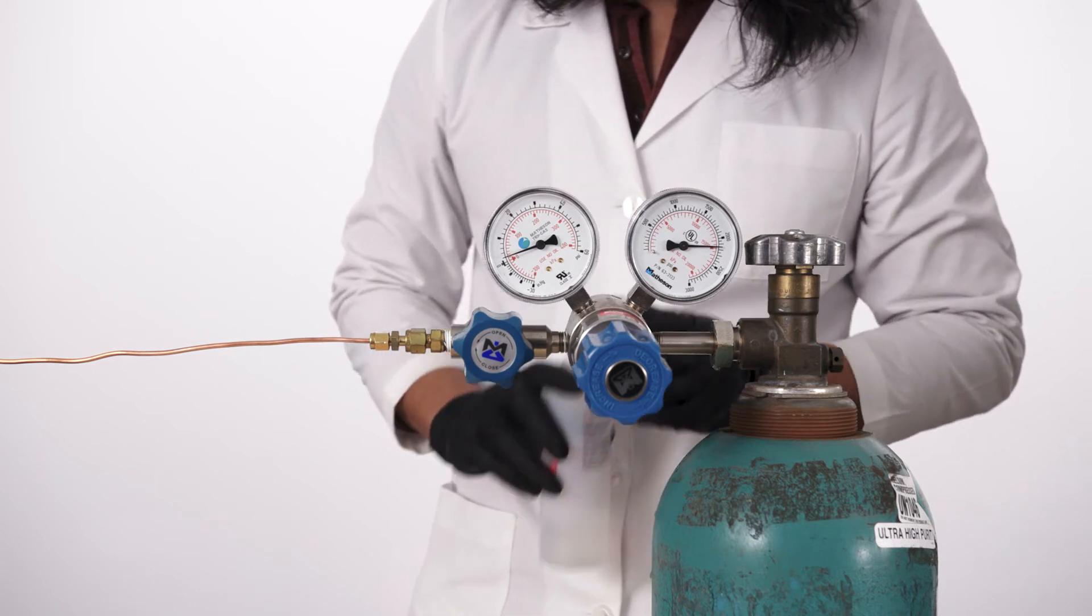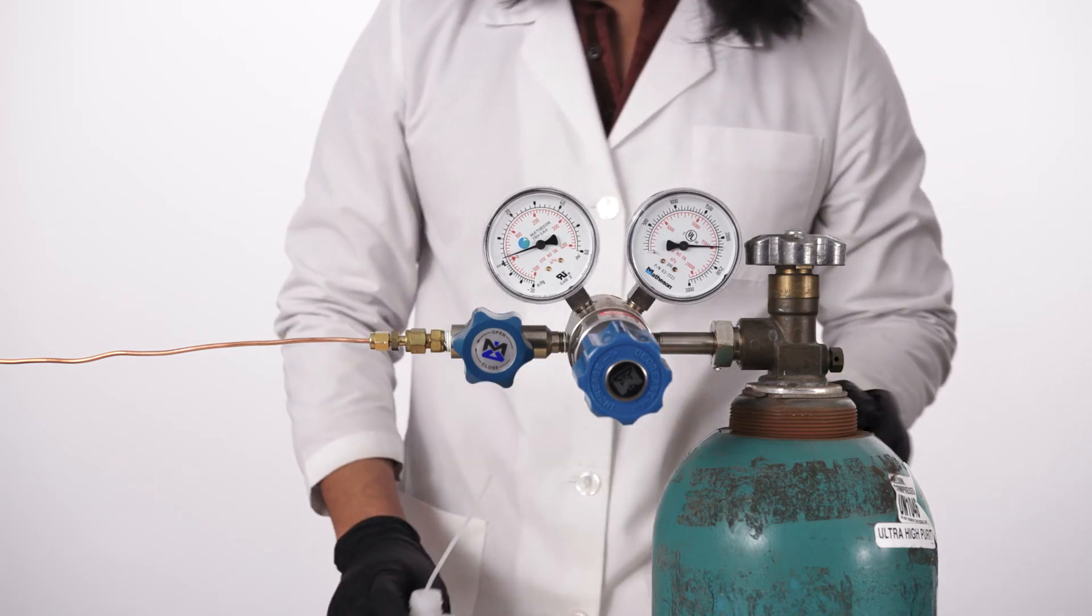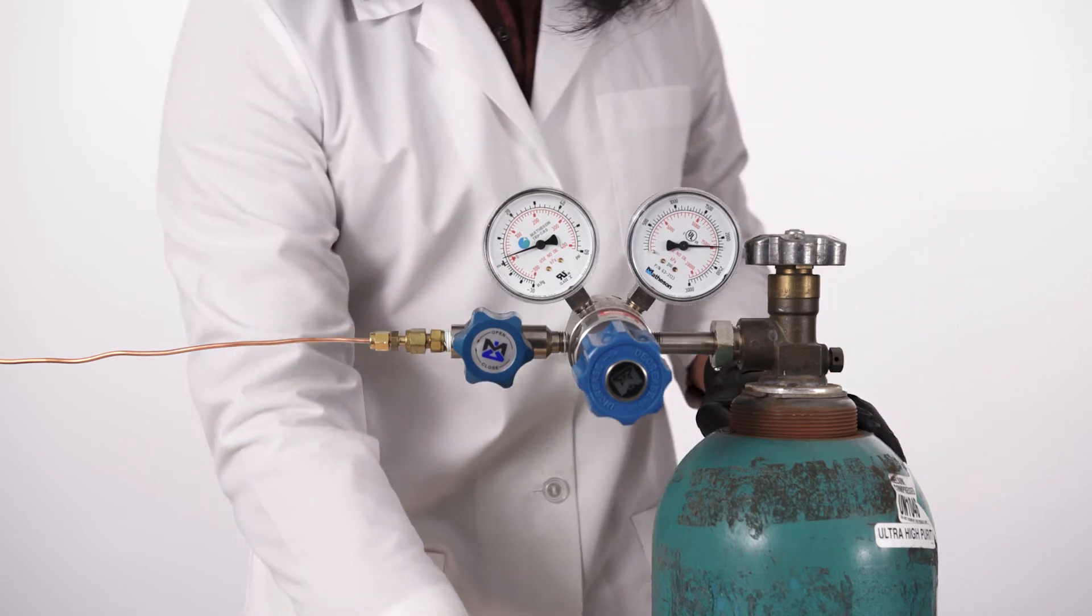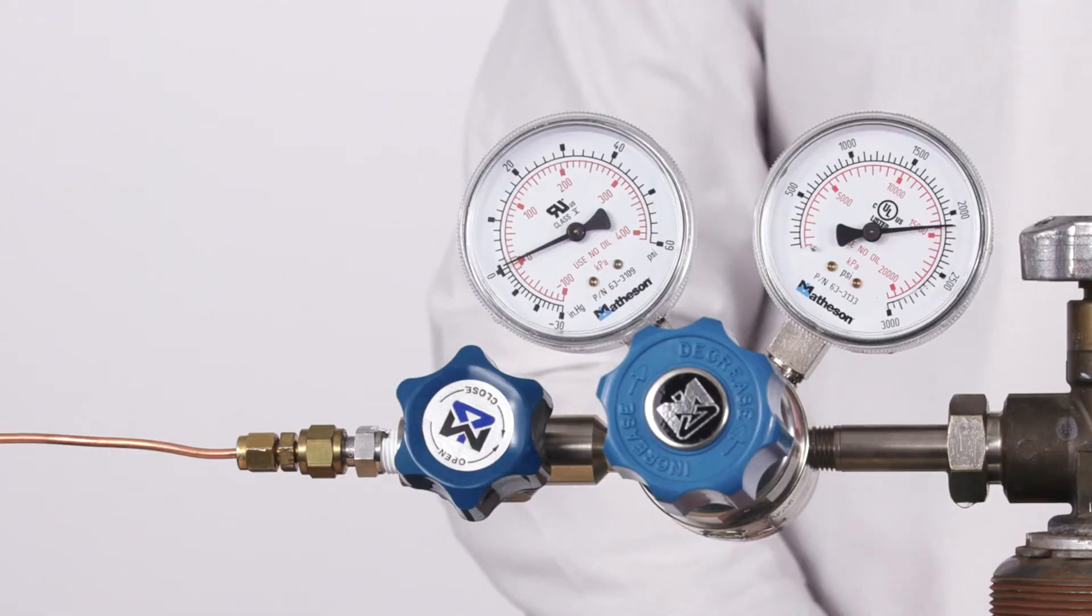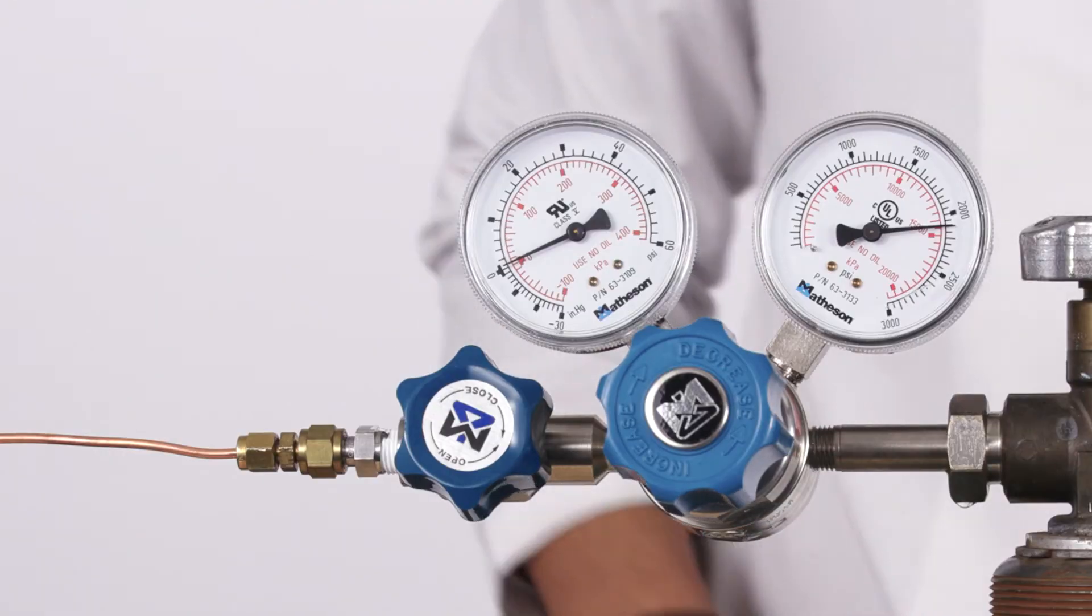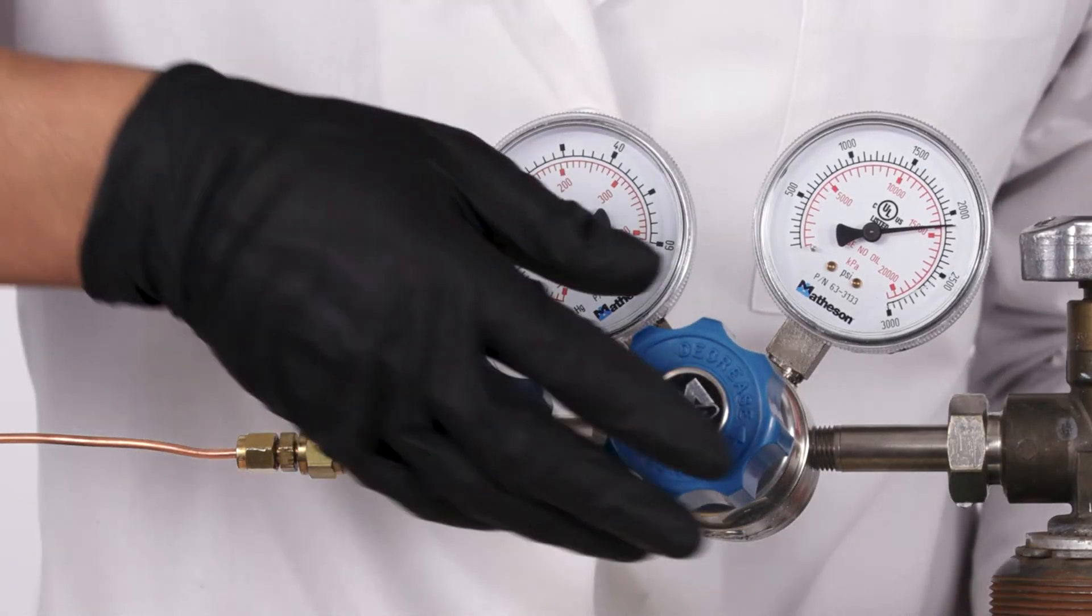If bubbles appear, tighten the fittings and recheck for leaks. Do not over-tighten the fittings.